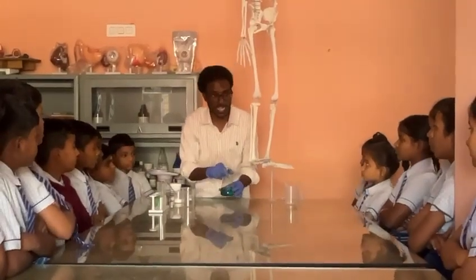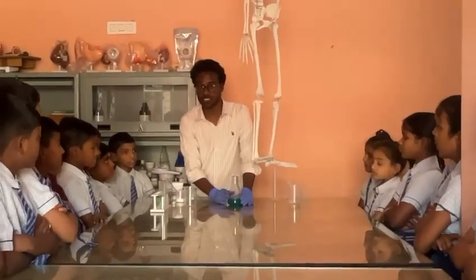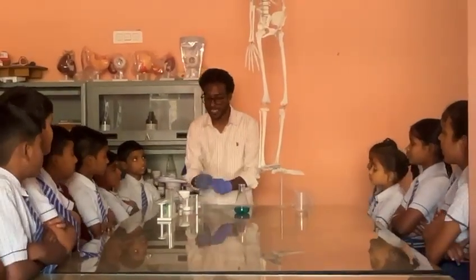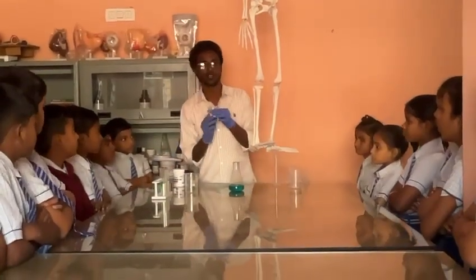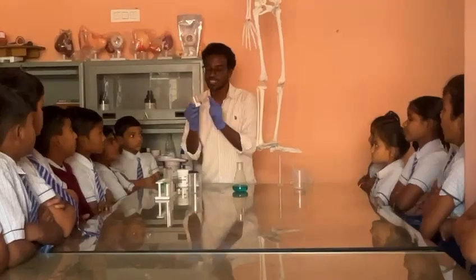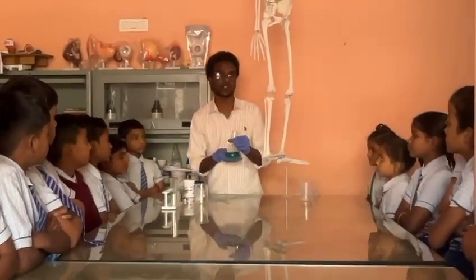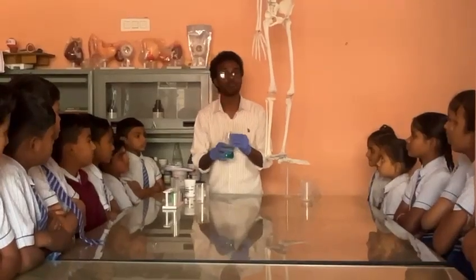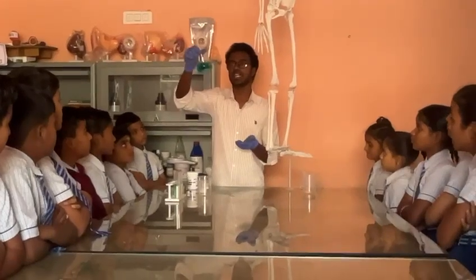I told you already the reaction. Copper sulfate consists of copper, and NaCl, sodium chloride, salt, has chloride, Cl. This Cl present in NaCl reacts with the copper present in copper sulfate. Because of that, the blue copper sulfate solution has now changed into green color.